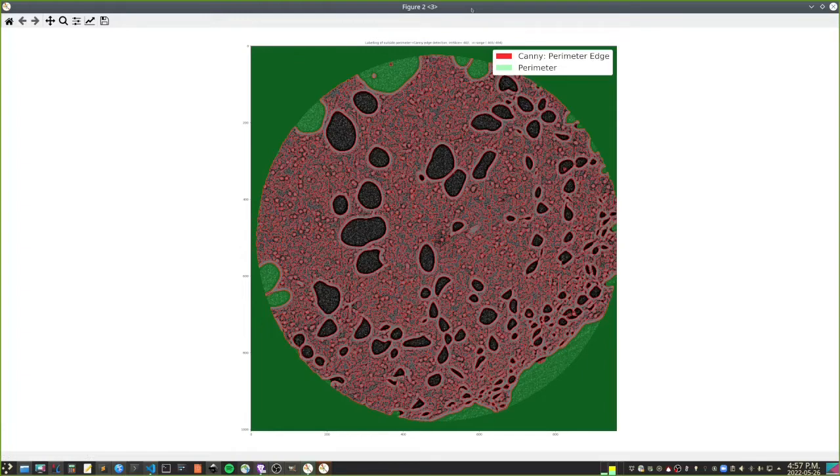Yes, we only have 4 pictures for now, and assuming the scan quality is pretty much the same across the entire volume, you don't need to check it on 50 pictures or even more. So it's going to work for all level sets. Well, we assume that, and you can check it afterwards.